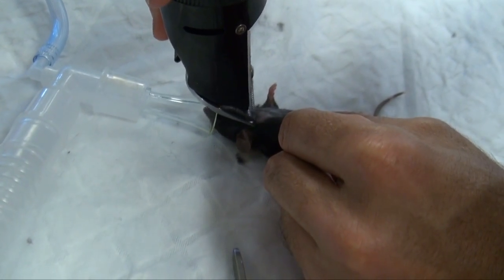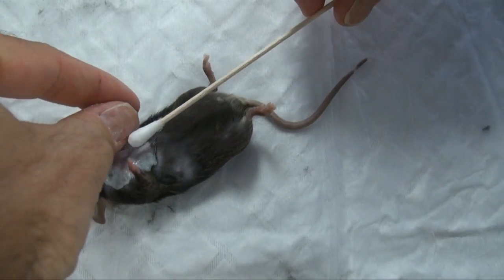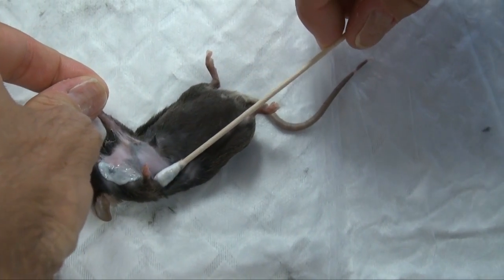Clip the ventral neck and upper thoracic regions and apply a chemical depilatory for 1 minute, then remove with cotton swabs, followed by an alcohol wipe.